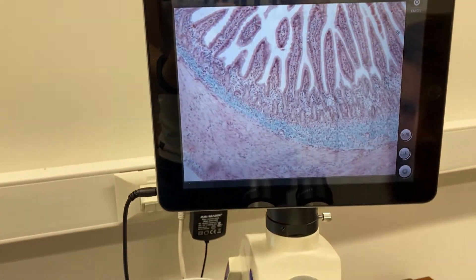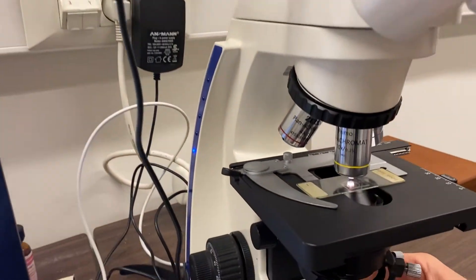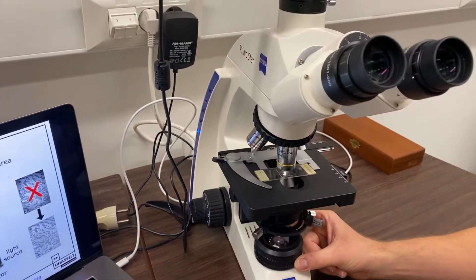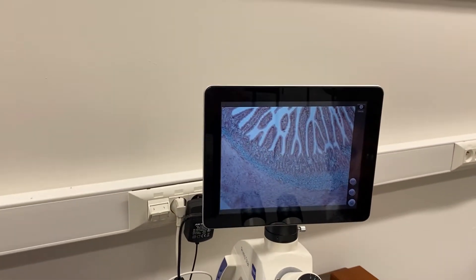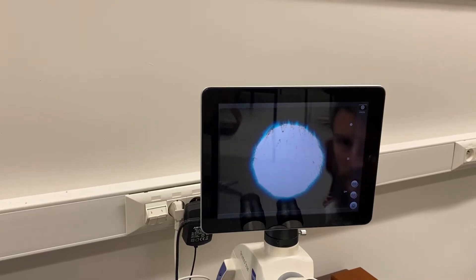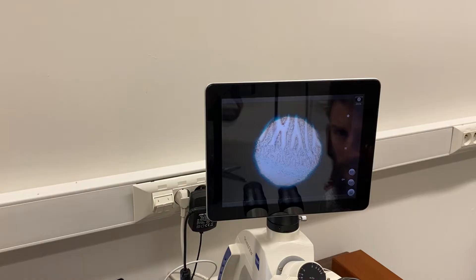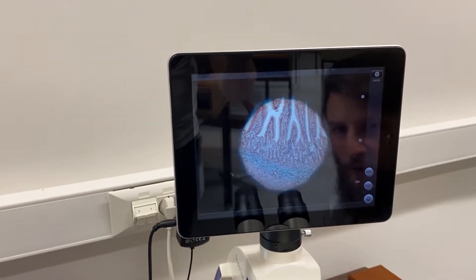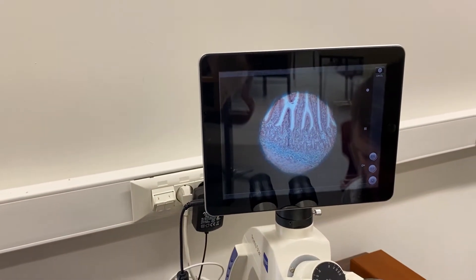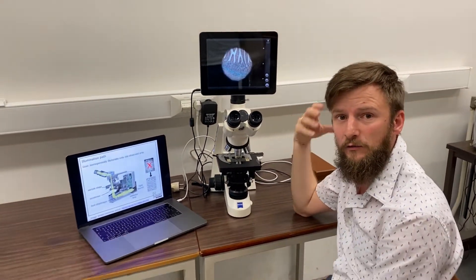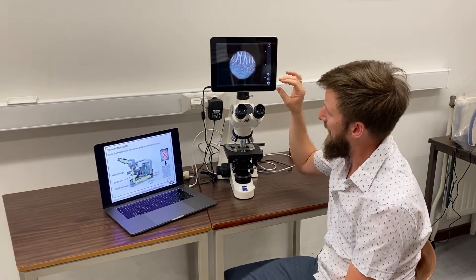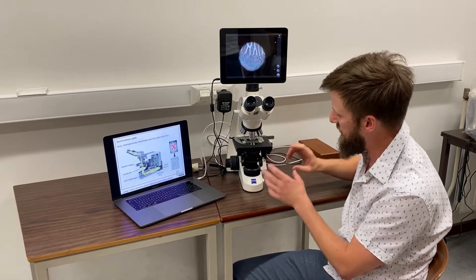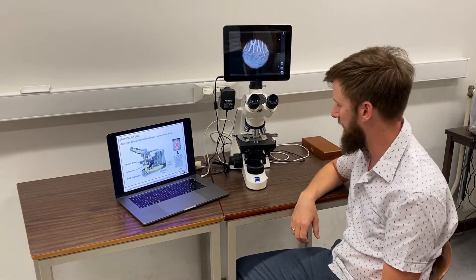This camera has automatic brightness scaling so you don't see this here. Now if I turn the ring that's holding the field diaphragm, at some point when the diameter of the field diaphragm is small enough, you will actually start to see the field diaphragm in the resulting image. You can nicely see the outline of the field diaphragm on the image here. If you change the field diaphragm diameter at the microscope and you don't see the outline of the field diaphragm, it means something is wrong in the alignment of the microscope. So it's very crucial to check whether you can actually see the outline of the field diaphragm in your images.